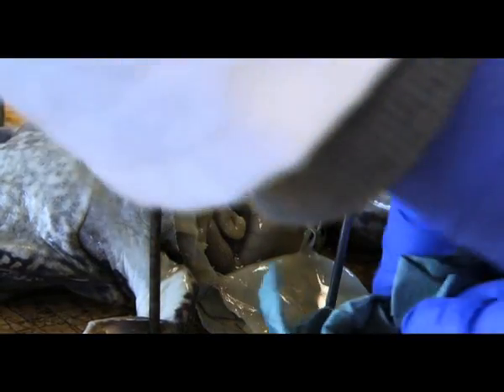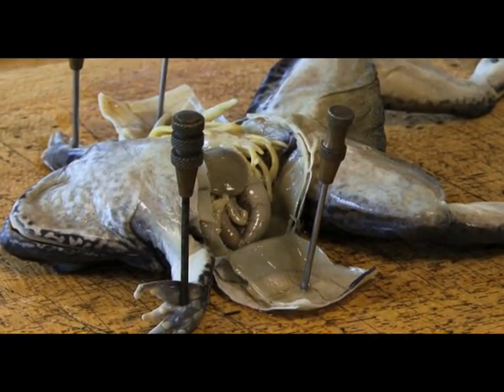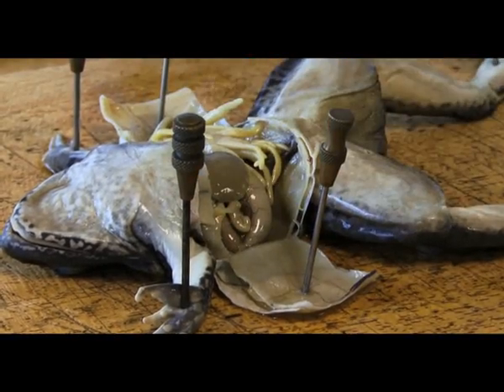Just dry off any of this excess fluid which is used to preserve these organs, and then we can see what we've got on the inside.